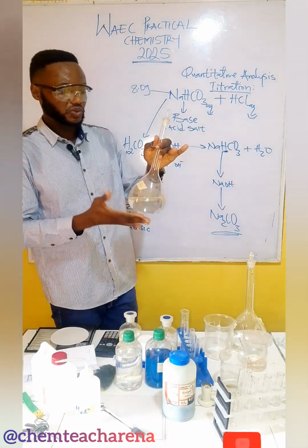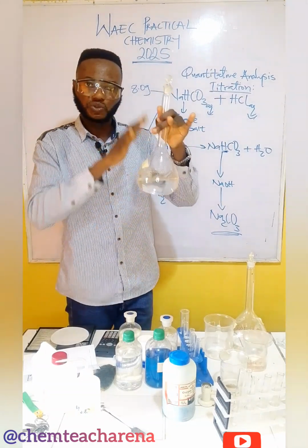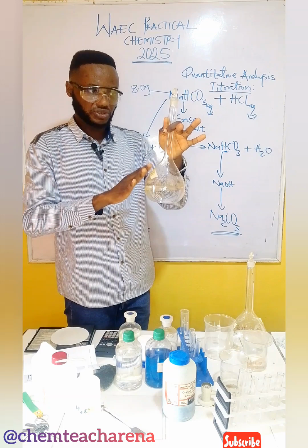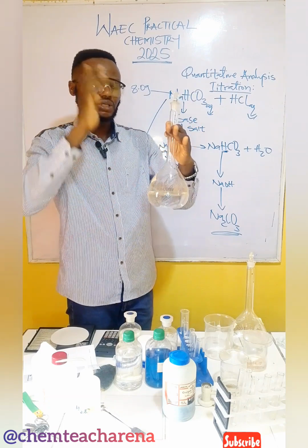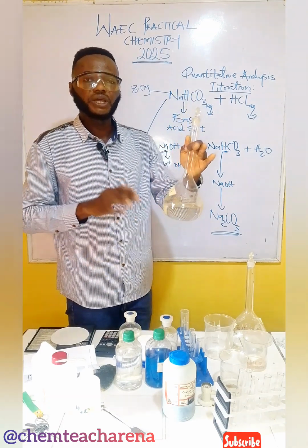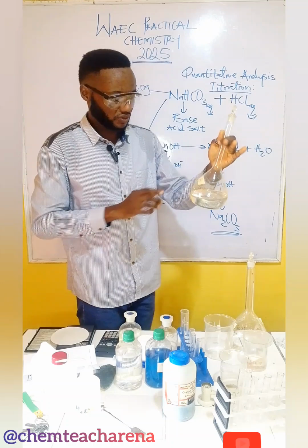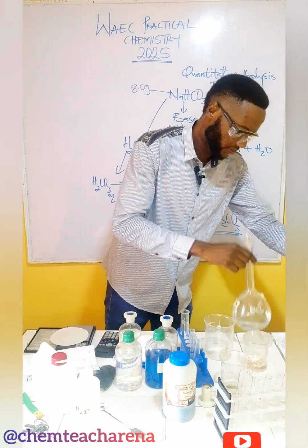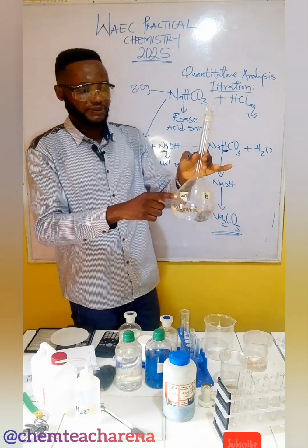So now you wash your materials very well, but most importantly, you wash this one very well. Then you rinse it with distilled water. After you have done that, I'm holding A. I should be holding B. So this is actually B.